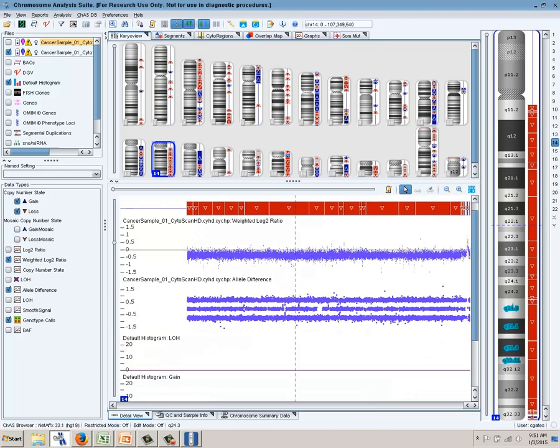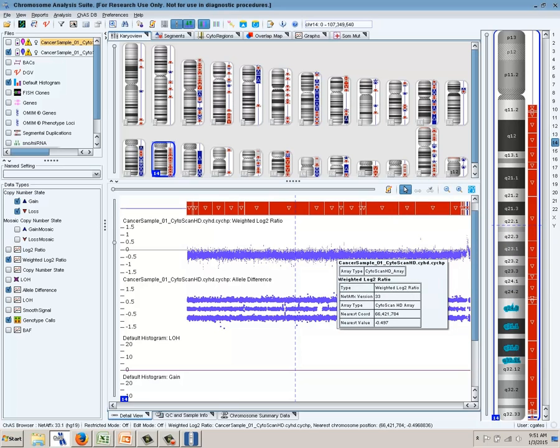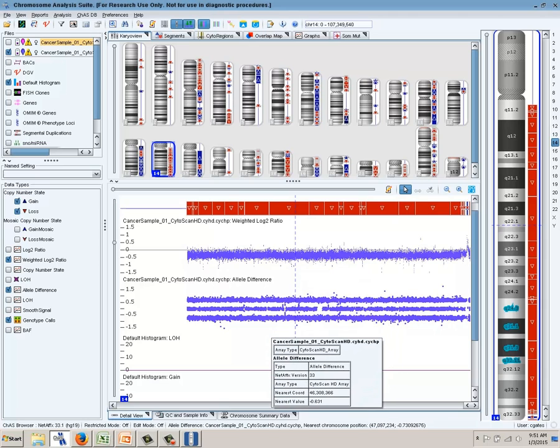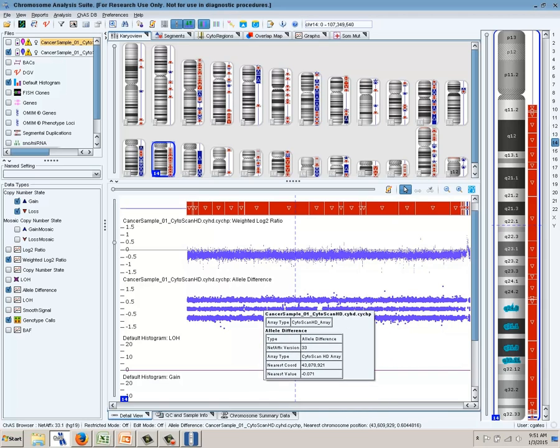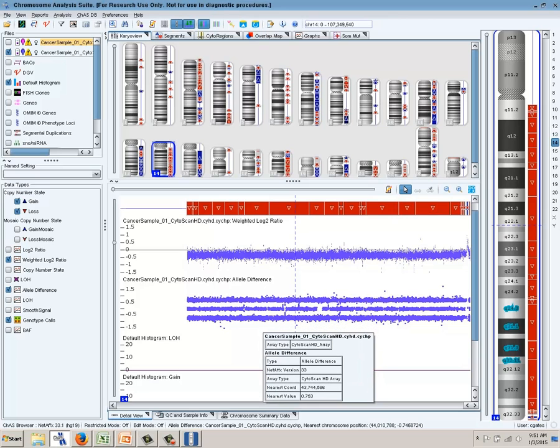If we look at chromosome 14, here we see that a loss is being called along the length of chromosome 14. The log2 is shifted downward, but we are seeing 3 tracks. And those 3 tracks being AA, AB, BB. So we know that there's no way that we can actually truly have a loss and have 3 SNP tracks.